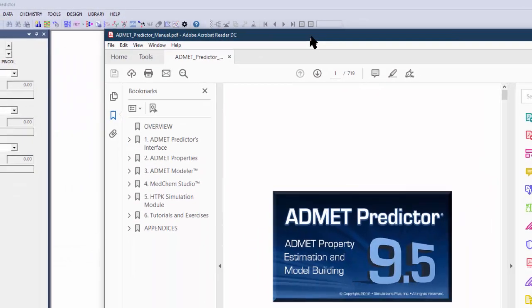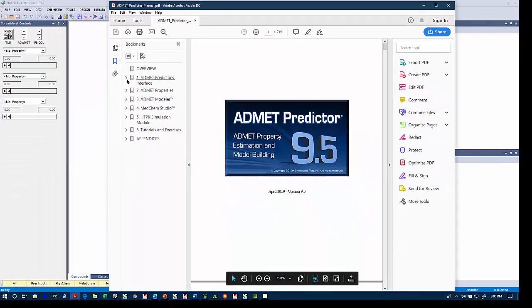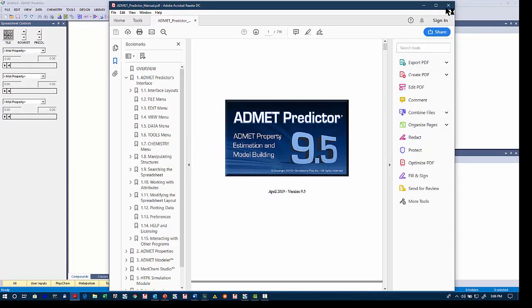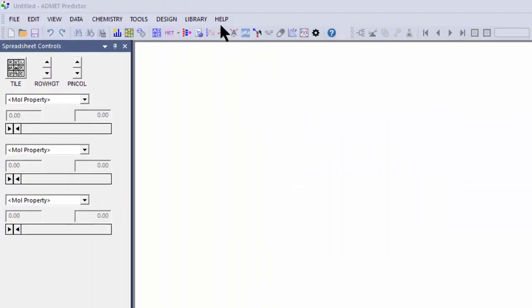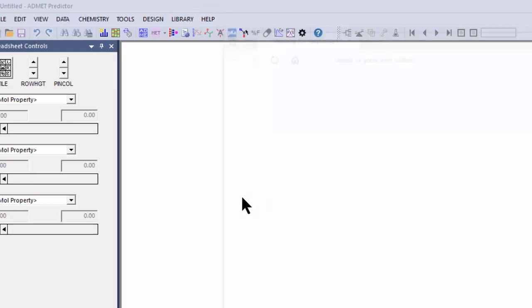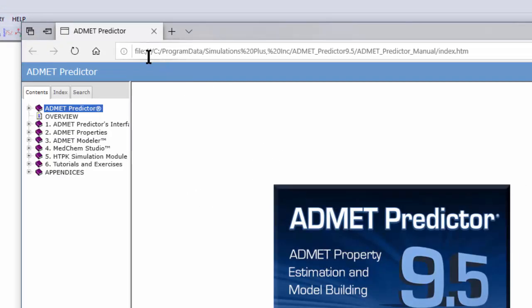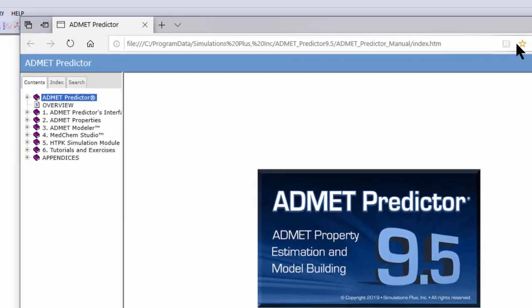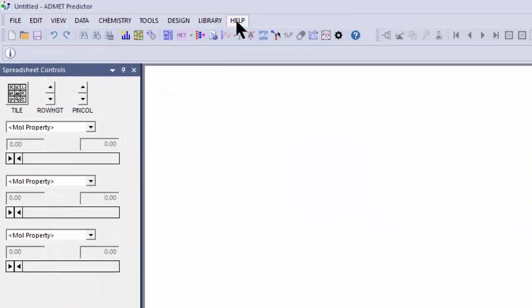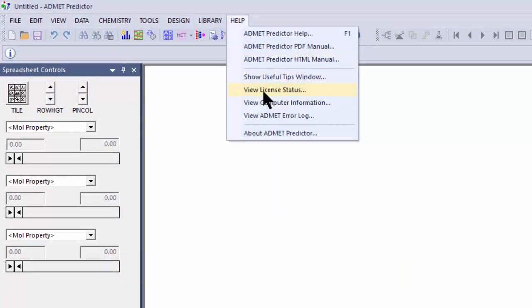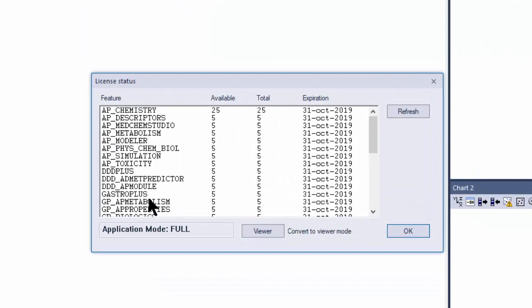You can also view the manual in PDF version — this is simply a PDF reader of the manual, and again you have the different options to search, et cetera. Finally, the other way you can read the manual is to look at an HTML file; this one opens your browser and goes to a specific file, and you could then bookmark this page. The last item under the Help menu is the View License Status button, which brings up a dialog box with all the licenses or features you have licensed, the number of users, the total number available, and the expiration date.